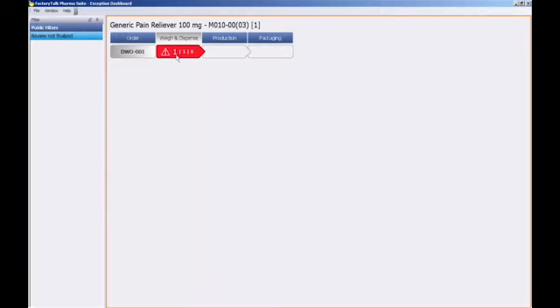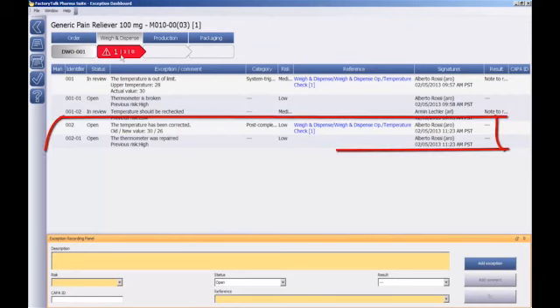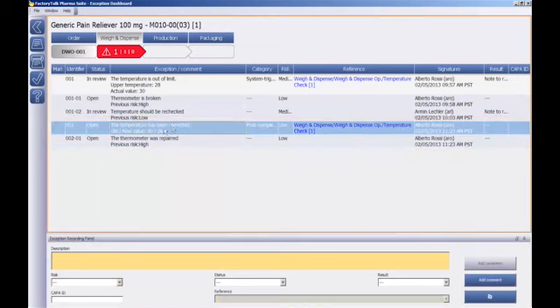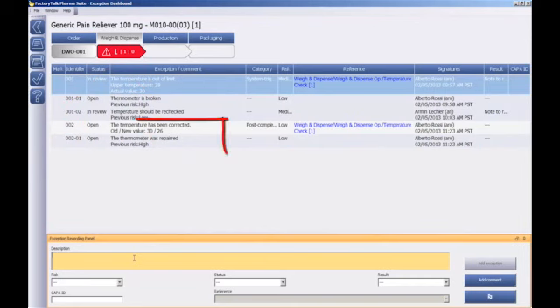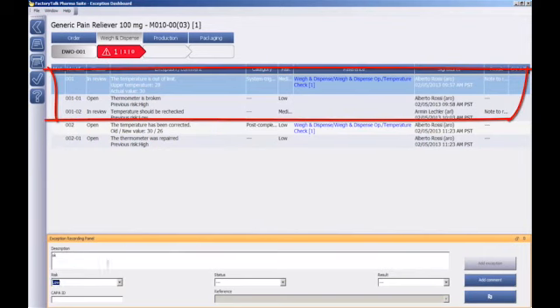Stepping back in our role as quality assurance personnel, we return to the Quality Assurance Office. Listed now is the exception that was generated during the final phase of the weigh and dispense operation, and an additional one related to the correction that was performed by the supervisor. Temperature has been corrected. With this explanation, we close the first exception. State that the risk is low, status is closed, result non-event. Add a comment and enter signature.